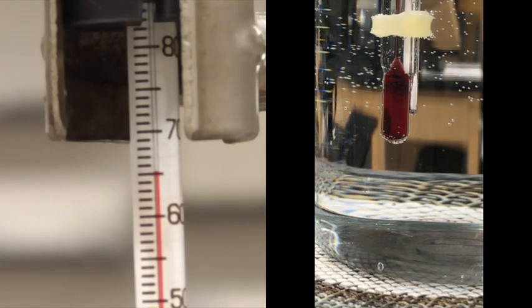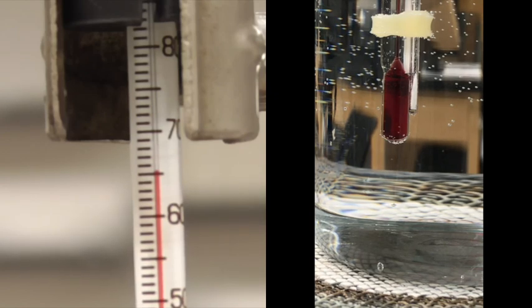So we'll put the Bunsen burner back in a little bit. Heat it up a little bit more. Take it out. A little bit more.